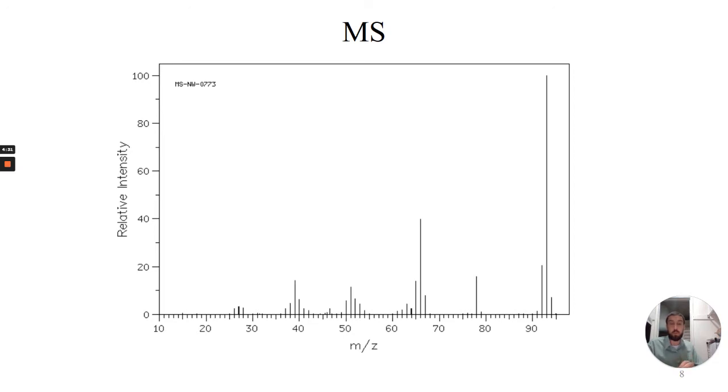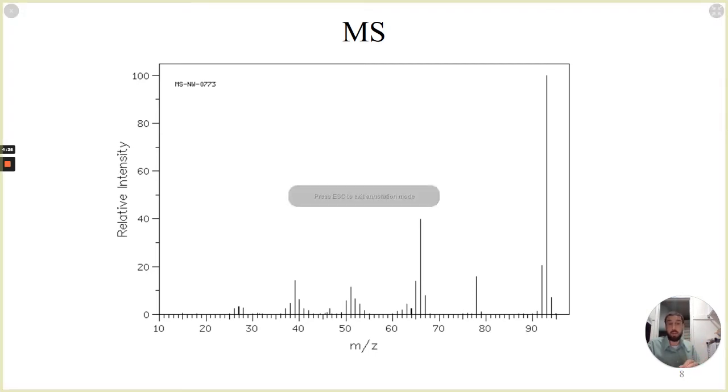Went a little bit over, but we'll go ahead and walk through it again. Again, thinking about the process, this is roughly how fast you should be moving. We're looking for the tallest peak furthest to the right. So we go furthest to the right, depending on how close you want to get. We can see those. The tallest peak within 3 units of that is going to be this guy. That's going to be my M plus peak. That M plus peak is at 1, 2, what is that, 3? Yeah, 93.